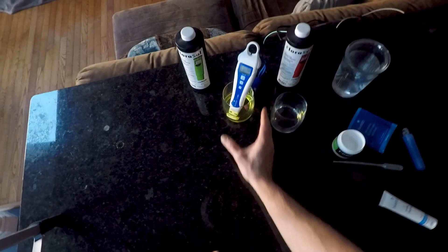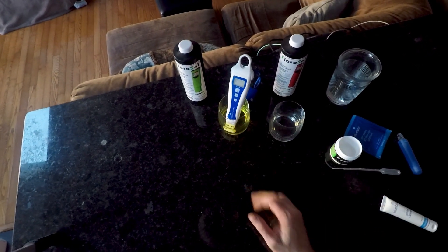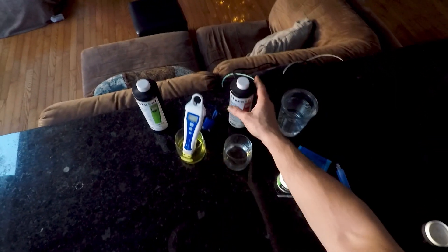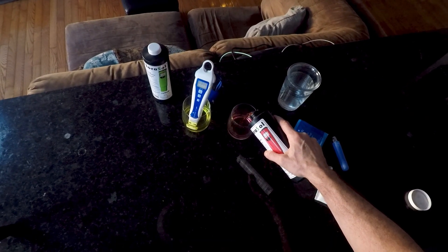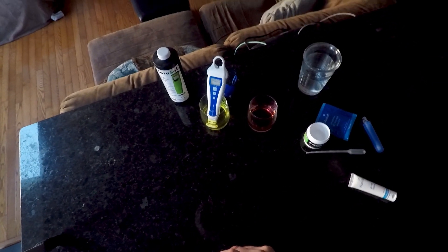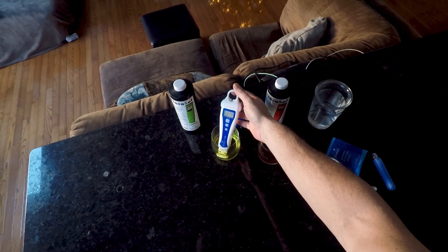Press Cal until Cal flashes. There's Cal. Let go and now it'll do its thing and then it will calibrate. While that's happening I'm gonna pour the 4.0 solution because that'll be next. There we go — 7.0.